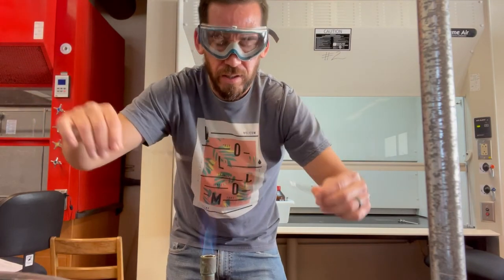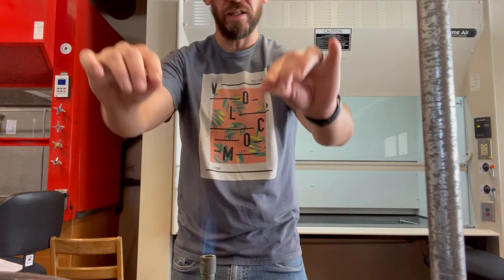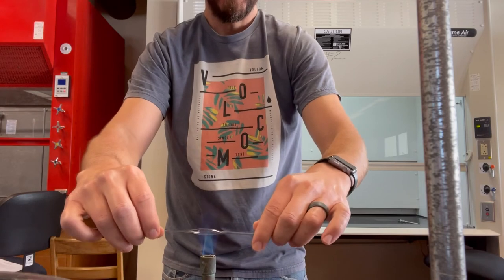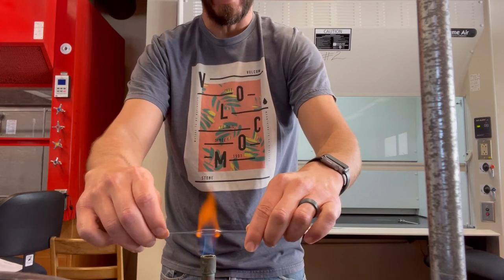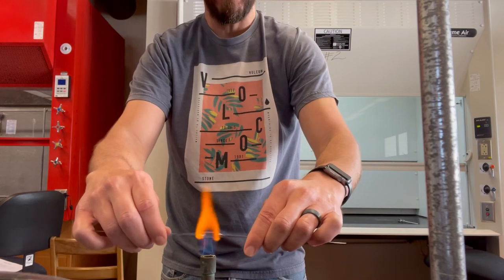But what I can do is just do it in the center part again after it has cooled off. And so we'll see if that works. Because you never know how many spotters you're going to need, or maybe you can make some for your friends, or maybe you're just in the mood to melt glass, so you can make a bunch right now and save them for later.